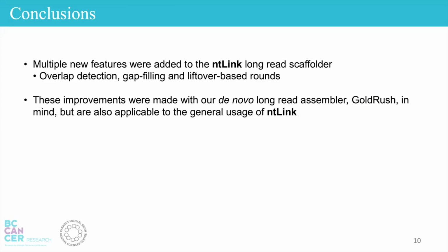So in conclusion, multiple new features were added to the ntLink long-read scaffolder, which were overlap detection, gap filling, and liftover-based rounds. While these improvements were made with our de novo long-read assembler GoldRush in mind, they're also applicable to the general usage of ntLink.